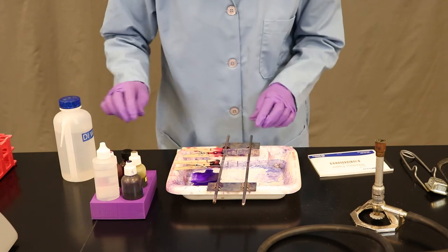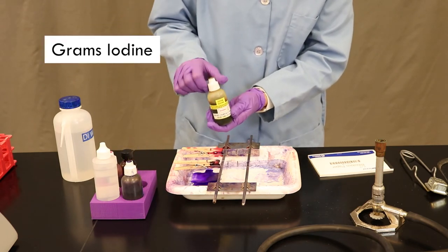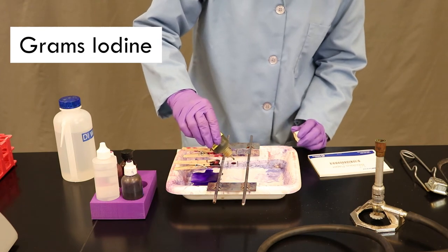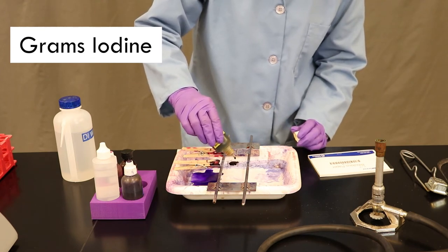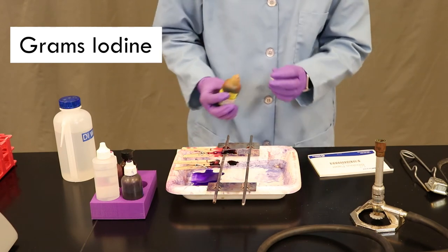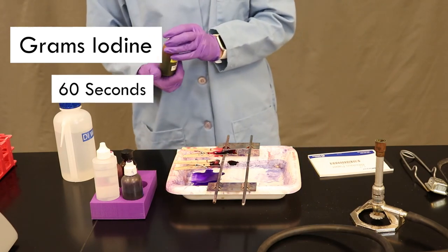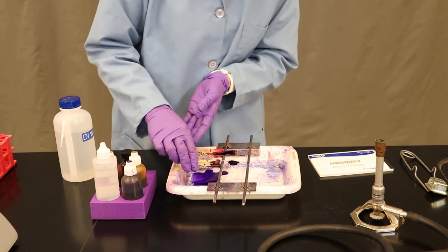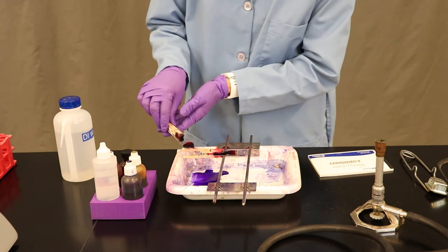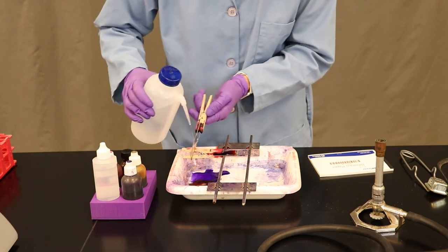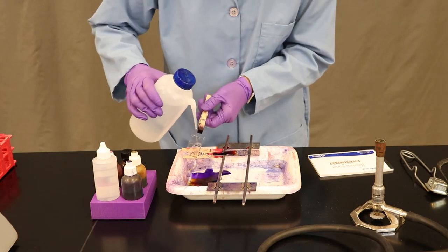The second chemical we're going to apply is called Gram's iodine, or the mordant. Again, flood the slide where your bacteria is located and apply the stain for no longer than 60 seconds. Once your 60 seconds has passed, rinse again with DI water until your droplets are clear coming off of the glass slide.